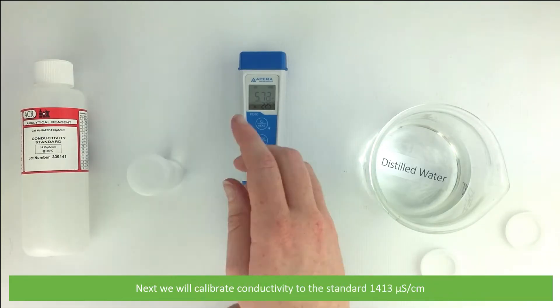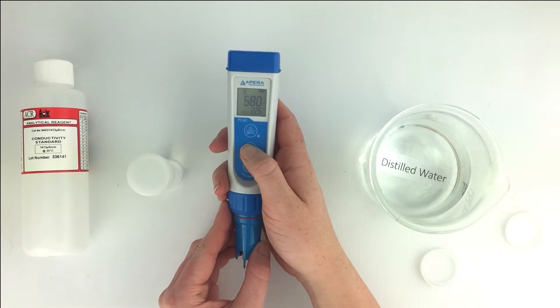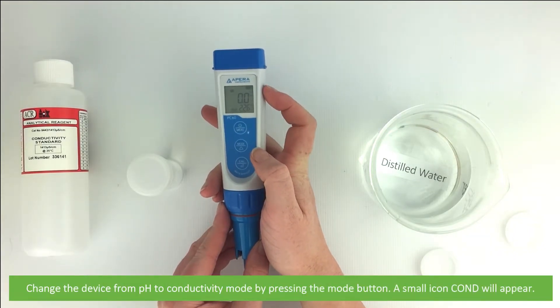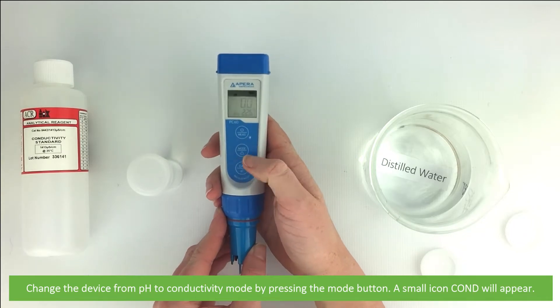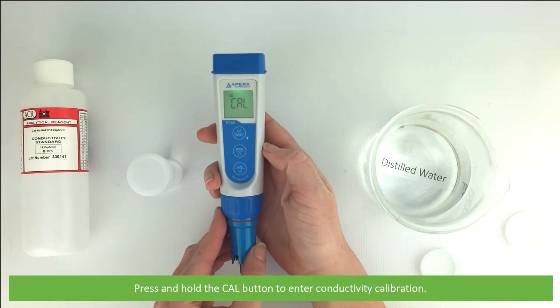Next we will calibrate conductivity to the standard 1413 microsiemens per centimeter. Change the device from pH to conductivity mode by pressing the mode button — a small icon reading COND will appear. Then press and hold the cal button to enter the conductivity calibration.